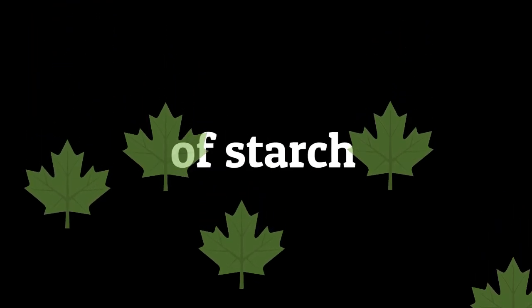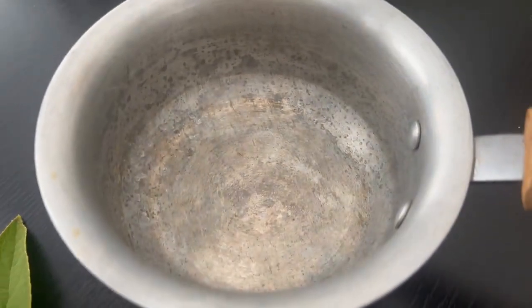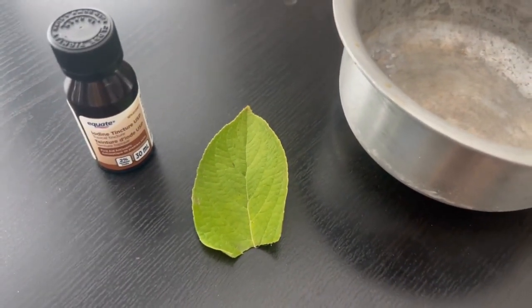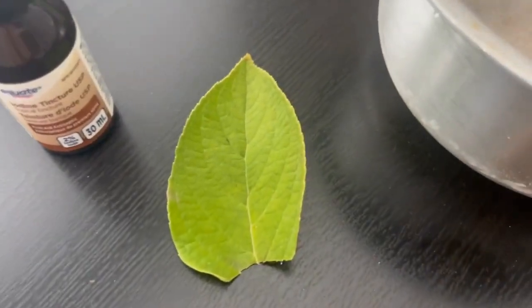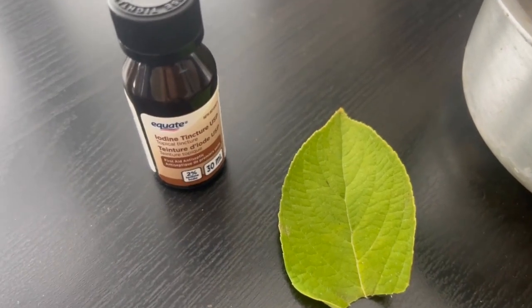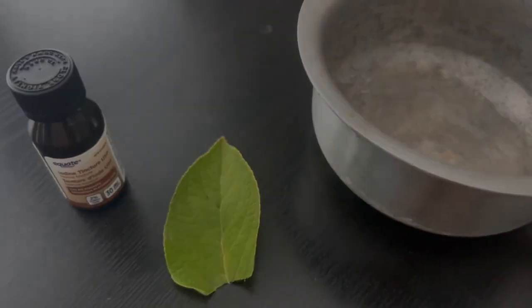Today we're going to be testing for the presence of starch in leaves. For this experiment, we'll need a small pot to fill up with water, a leaf that has recently been exposed to the sun so that it's recently done photosynthesis — this one I just ripped out from my garden — some iodine solution that you can probably get anywhere, and of course we'll need water.